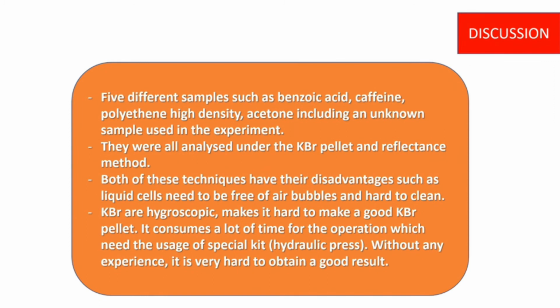It consumes a lot of time for the operation. The operation also needs the usage of a special kit, which in this case is the hydraulic press. Only a good operator with experience can make a good KBr pellet. Without experience, it is very hard for us to obtain a good result.